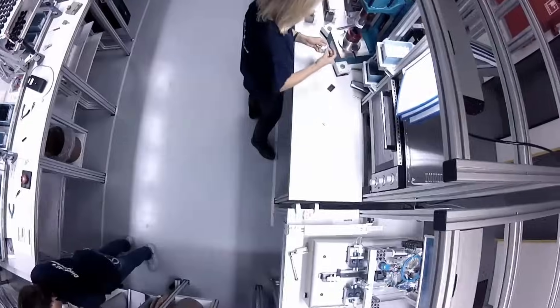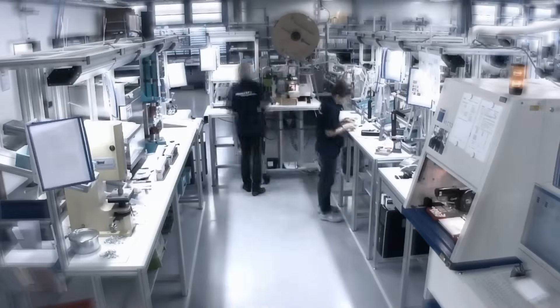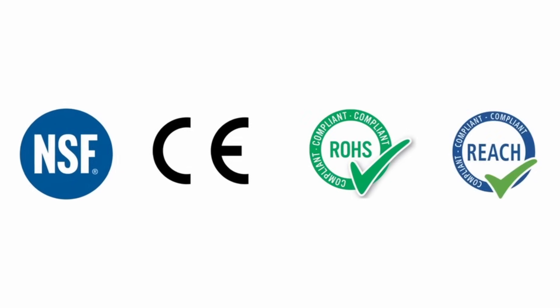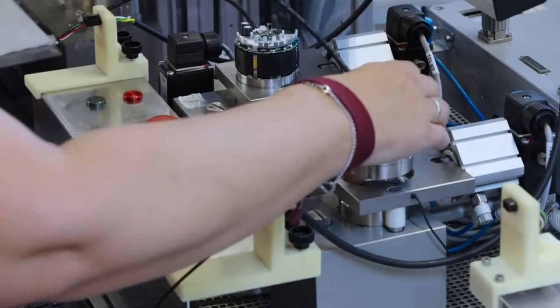Built with precision machining and high-performance materials, the Xacta is optimized for long service life, even in the most demanding environments. Customizable wetted materials ensure compatibility with a wide range of fluids.